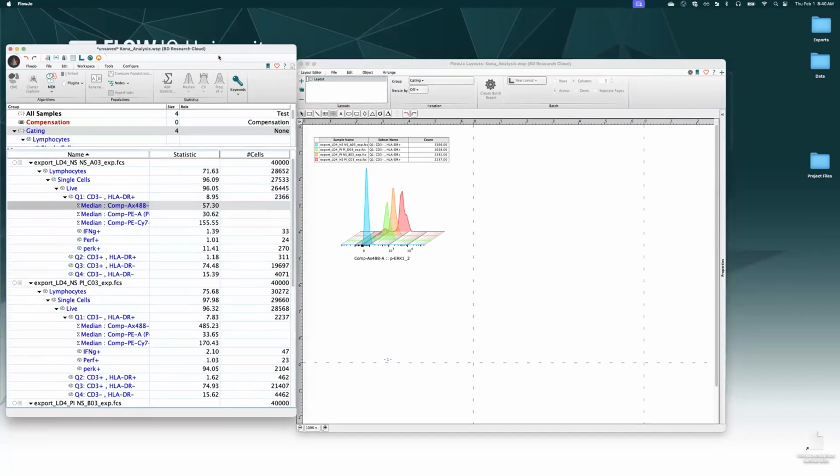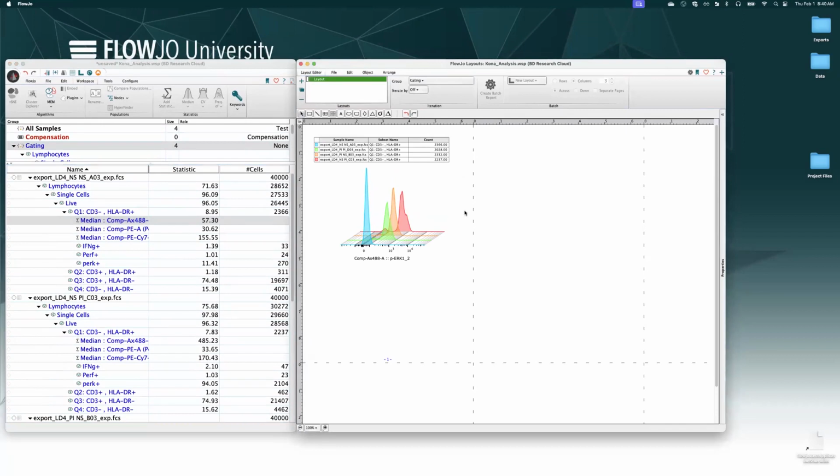Now, if I want to use this later to batch, and if I have more than the 4 files as I do in this workspace, but I still want sets of these 4 files overlaid and generated for each set of 4 files, I need to set up my iteration band and save that as a template pre-batch. So basically I'm choosing the group.